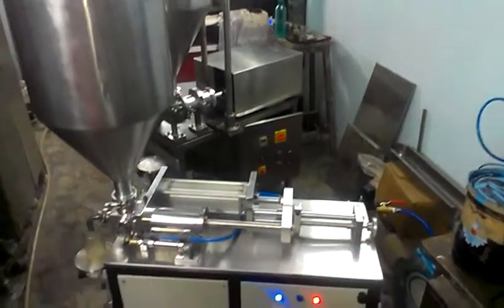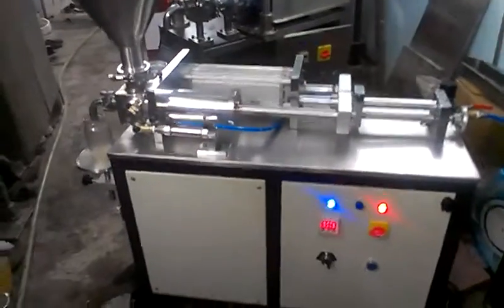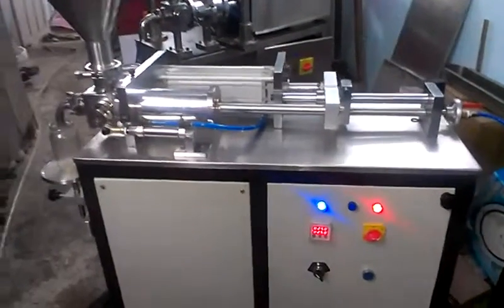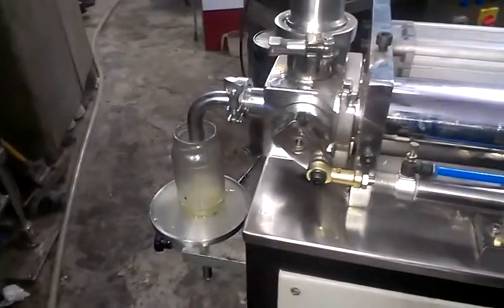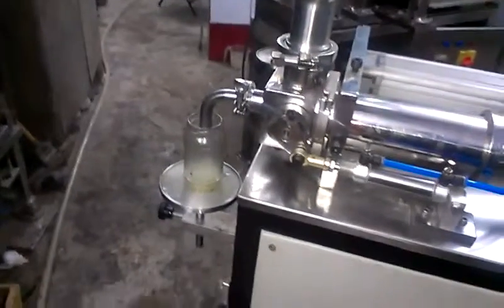This is a pneumatically operated paste and liquid filling machine, single head. This machine can fill from 1 ml to 1000 ml. Both paste and liquid can be handled by this machine. We can show you a small demo video.